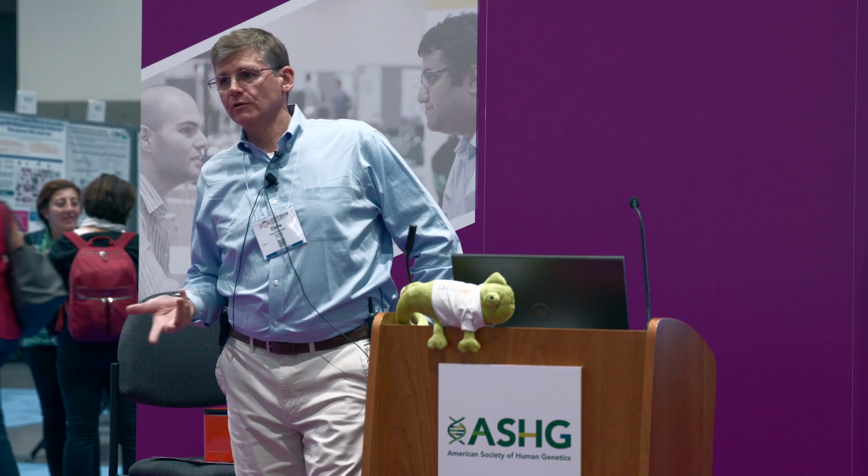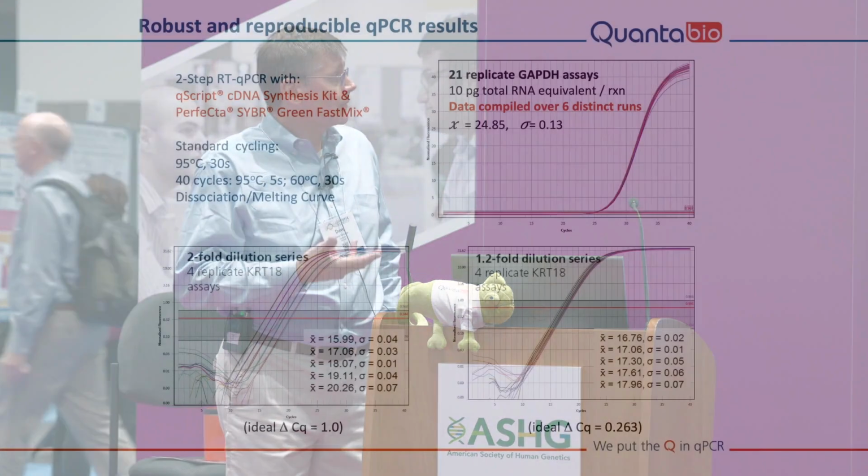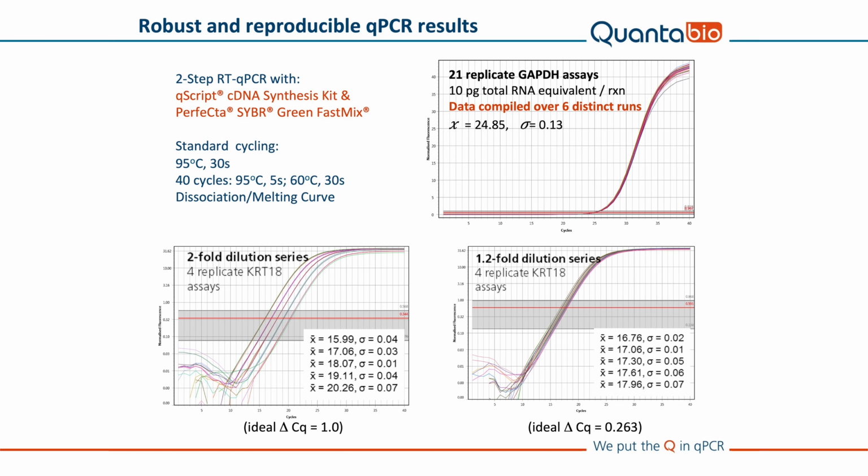Now, how does this temperature uniformity translate into your more routine use of qPCR for relative gene expression analysis? In this case, this is just an example of a 2-step RT-qPCR. cDNA synthesis was generated with our qScript cDNA synthesis kit, and then we looked at a dilution of that and amplified product with SYBR Green Fast Mix, using pretty much just the standard cycling conditions that we recommend for the product.